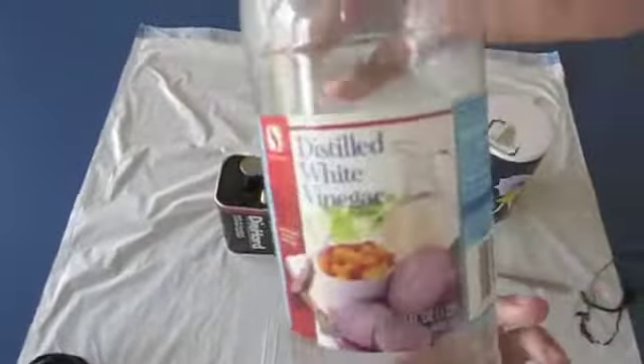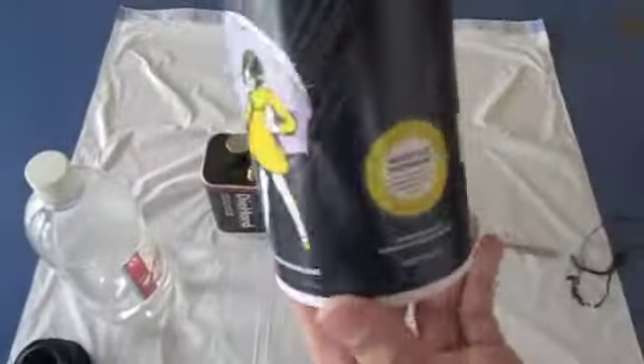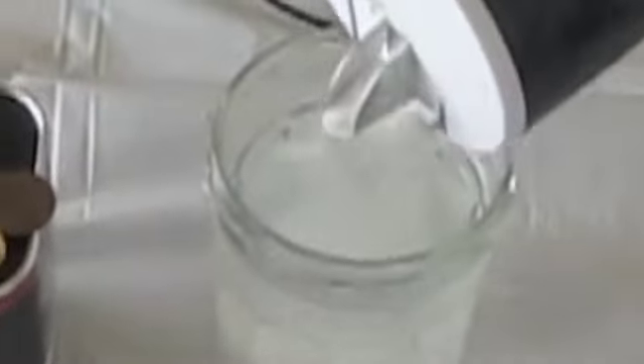We started off by pouring about one cup full of vinegar. Next, we added a good amount of salt and stirred it well to increase the conductivity of the vinegar.